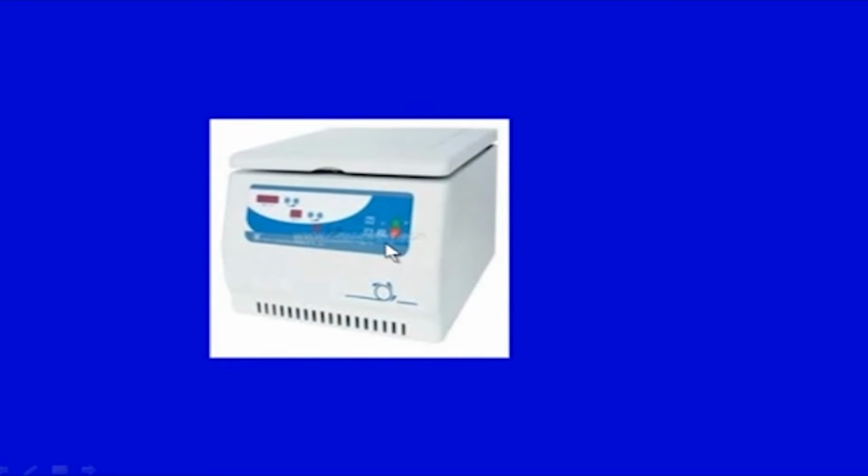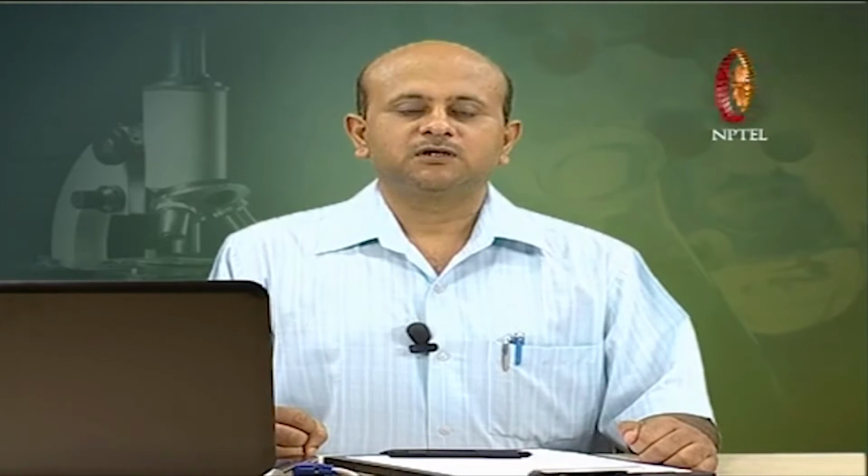This is a very typical high speed refrigerated centrifuge. All these centrifuges could be obtained from different companies, a lot of makes are available, and one can compare and acquire one or many of them to work upon.